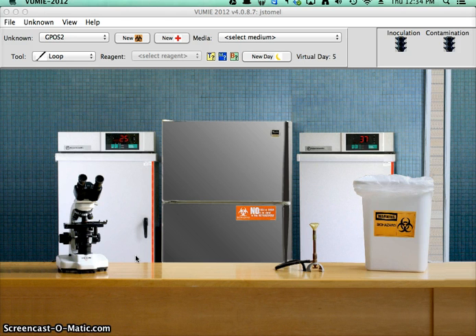I've noticed that some of you have had problems negotiating your way around the lab software, so I'm going to go through and do the Module 1 exercises, at least the tube and plate transfers, in two separate videos, and sort of show you the ropes of how to do it. And we'll see how this goes.